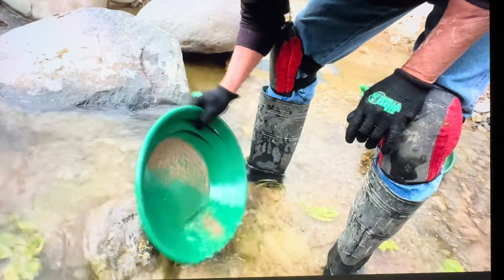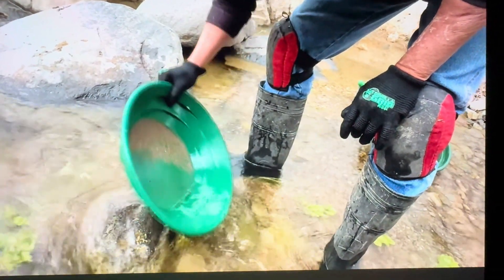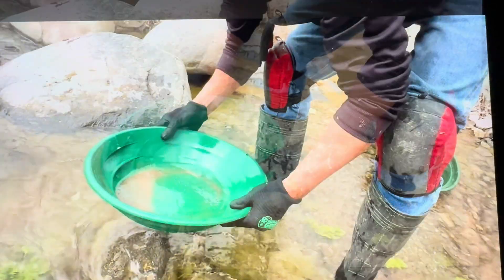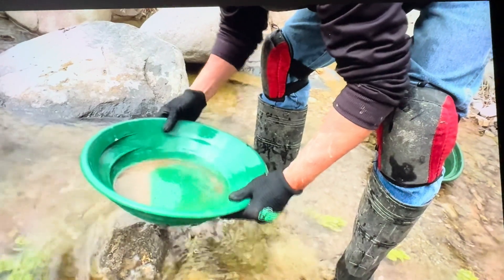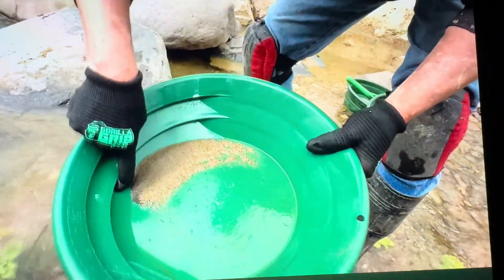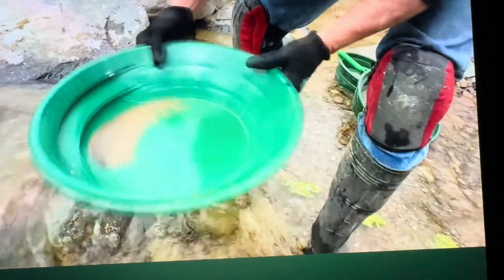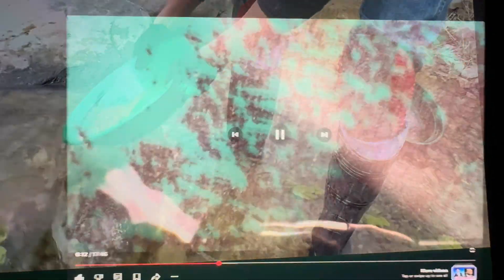You can see some black sand down inside of it, but I don't see any gold — at least not yet. Here it is, I see some gold, it's coming up. I don't know if you could see it right there. There we go — you can see all that fine gold that's inside the black sand.